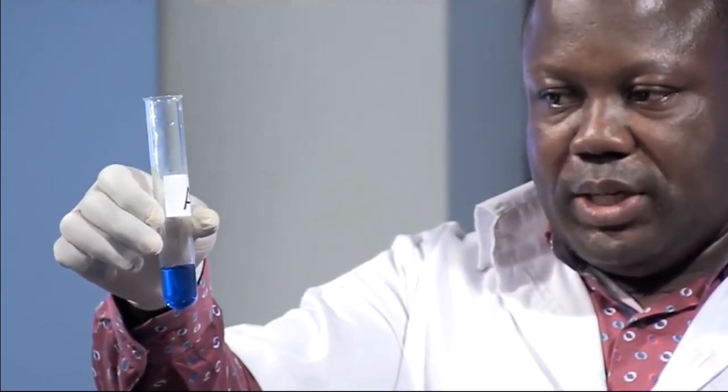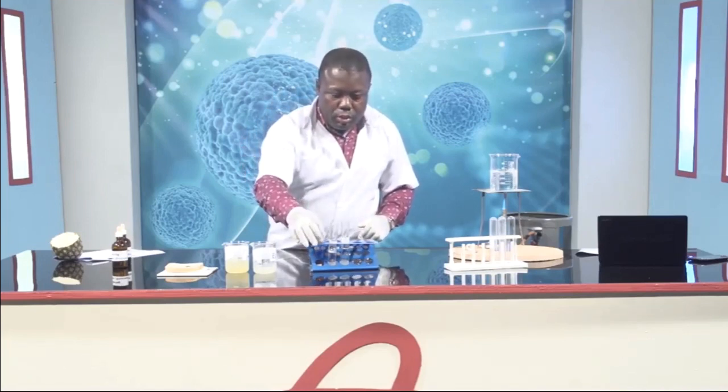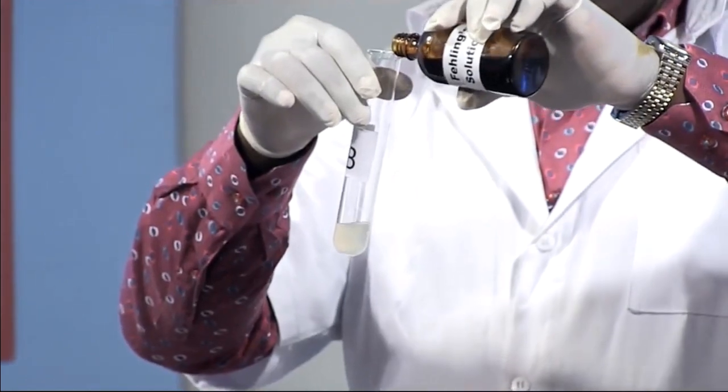I want you to observe. Initially, we had a colorless solution. Now the solution is blue. Very, very important: it was colorless, now it's blue. We take that of B and add 2 cm cube.